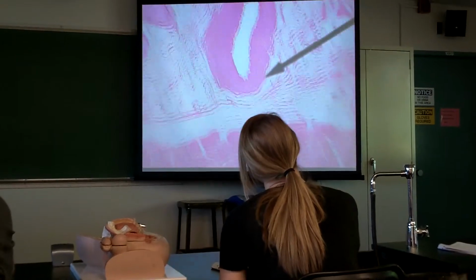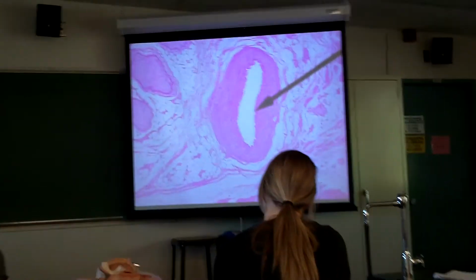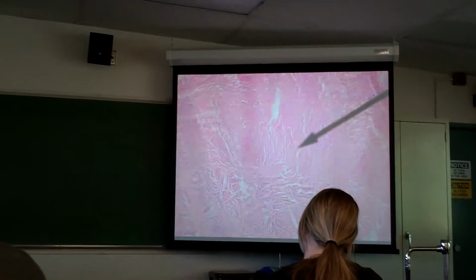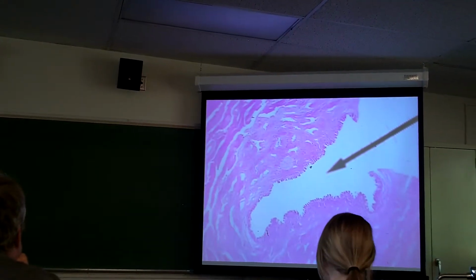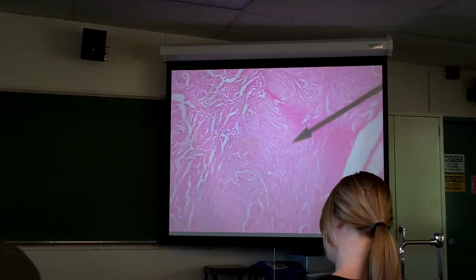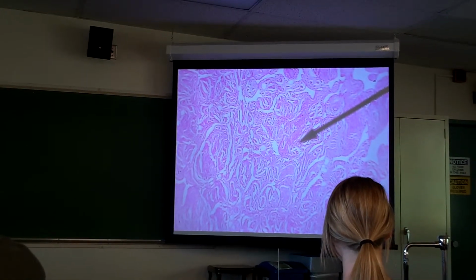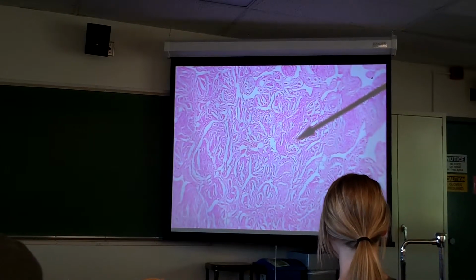So anyway, if you see a blood vessel but don't see a vas deferens inside, you can assume you're looking at a penis slide. The dorsal blood vessel. Get to know what erectile tissue looks like with all those open chambers, and then be able to recognize the urethra. Can you go back to the cavernosa? Sure. Right through there. That's all corpora cavernosa, all that erectile tissue. So again, it's got kind of an interesting look to it. It's kind of swirly open spaces.